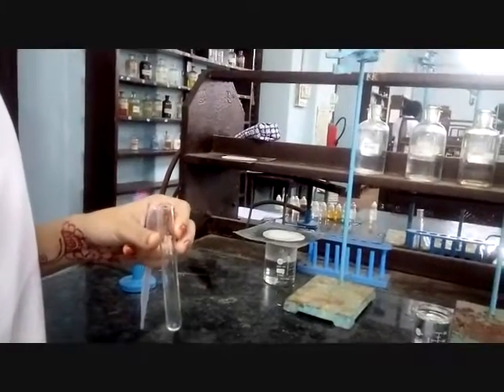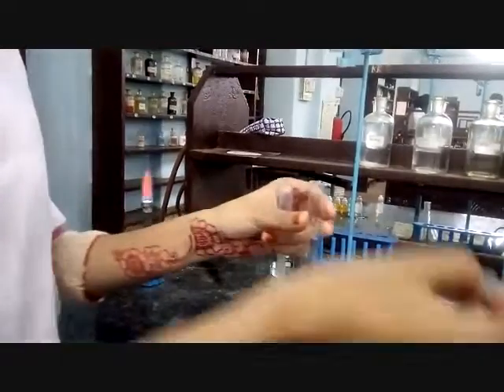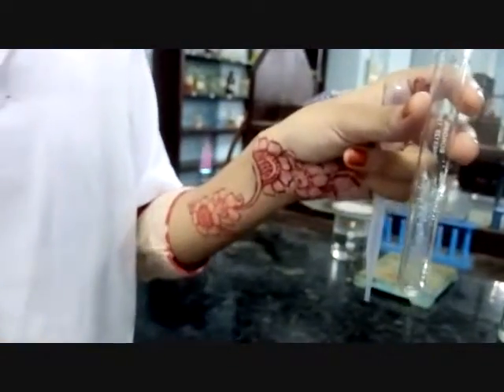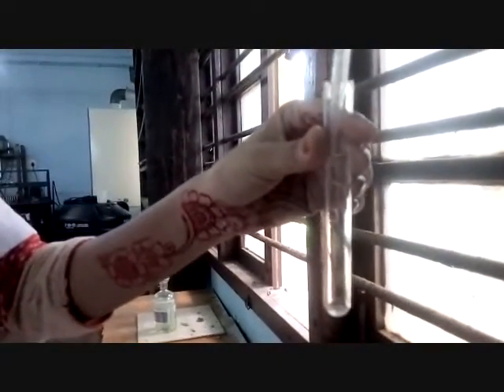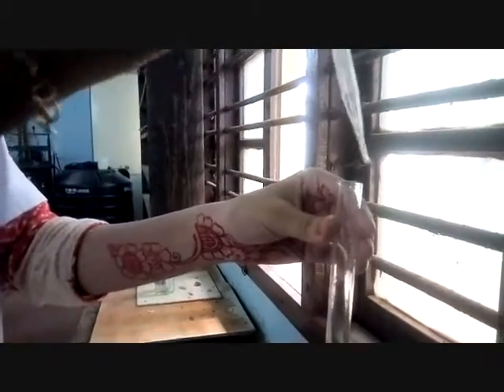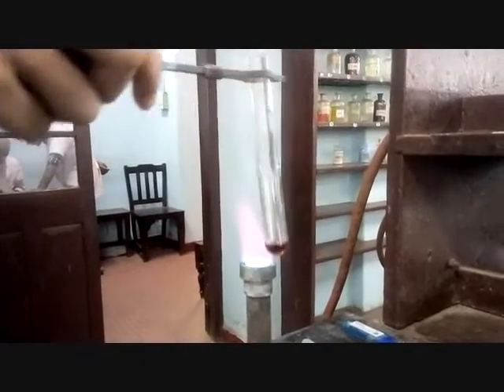Action with concentrated H2SO4. Take a little of the compound in a test tube and add concentrated H2SO4, and warm it.